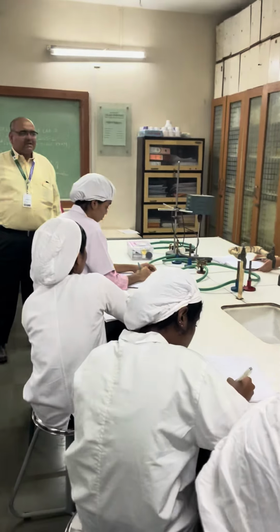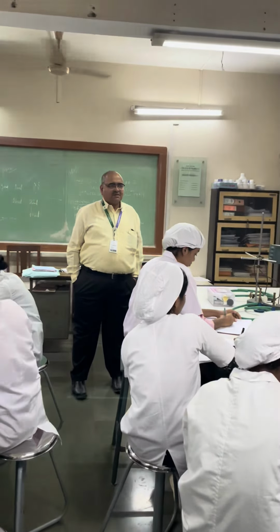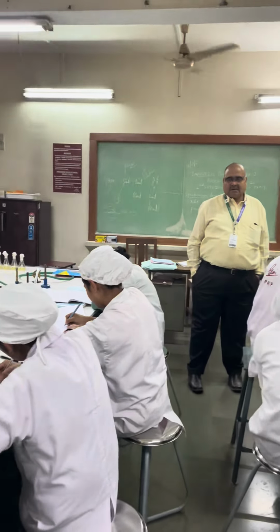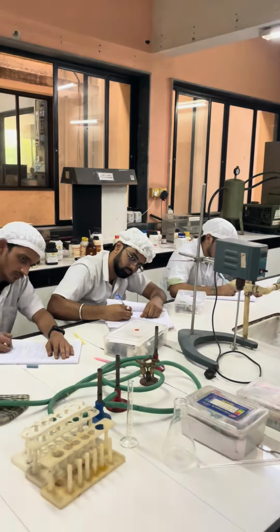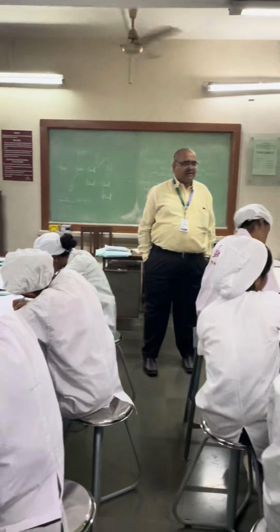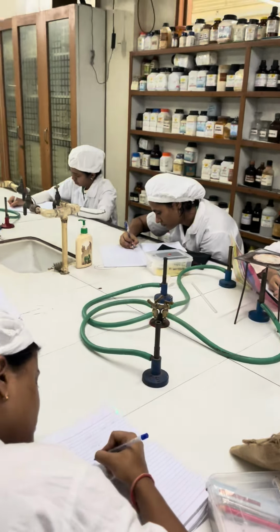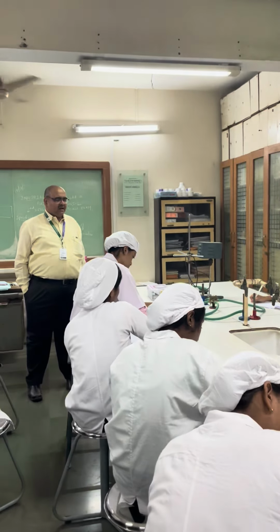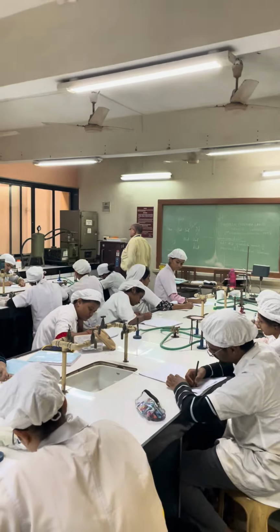Now, after arrangement of these lactose broth test tubes in rows, using a sterile pipette, add 10 ml of water sample to all 3 double strength lactose fermentation broth test tubes from the first row.